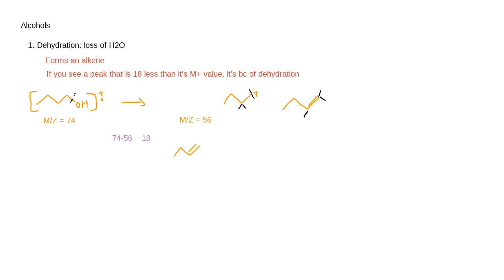Okay, so the second part is alpha cleavage.